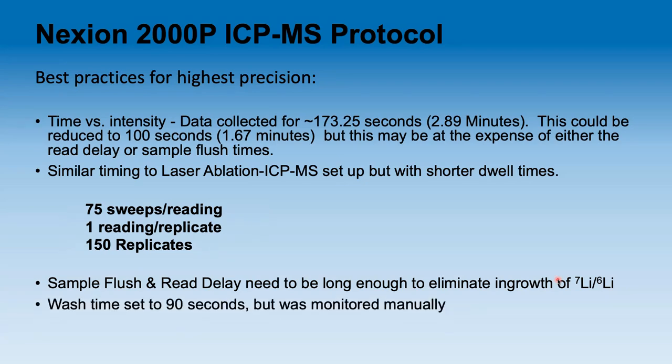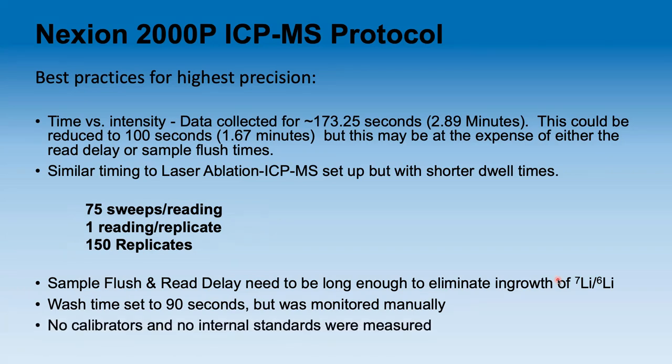We want to set our wash time to 90 seconds, but you know, feel free to manually monitor it. Say that 6 times fast. So basically we want to make sure that the lithium gets out, and lithium is pretty mobile. So if you rinse with a 2% nitric, it should come out of the lines quite easily.